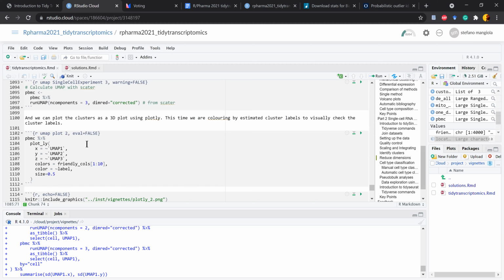And okay, that's it. And one other nice thing that I want to show you is that we can interface ggplot with our single cell data now, but we can also interface with Plotly. It is a very powerful library. Again, because of the tidy representation.